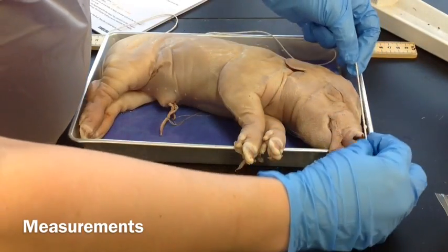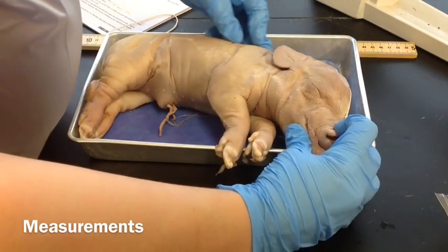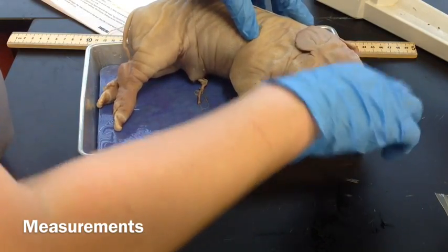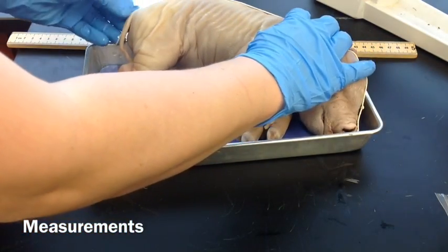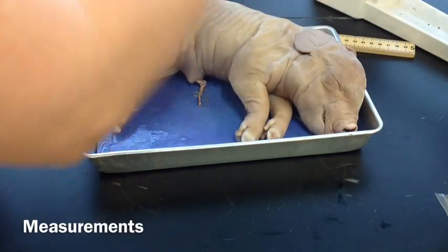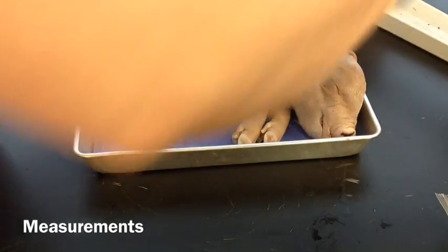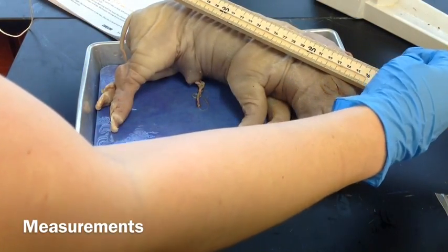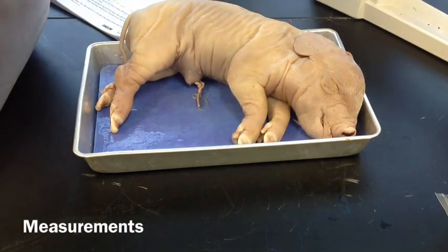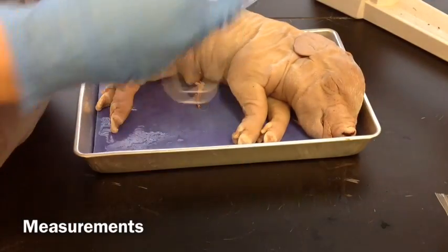Put the end of the string at the tip of the nose — the nostril right here — and run it across the back all the way to the base of the tail, which is where the tail is attached to the pig. We measure that against our ruler and it is 36 centimeters. According to our manual, 36 centimeters is a full-term pig, so this pig would have been almost born.